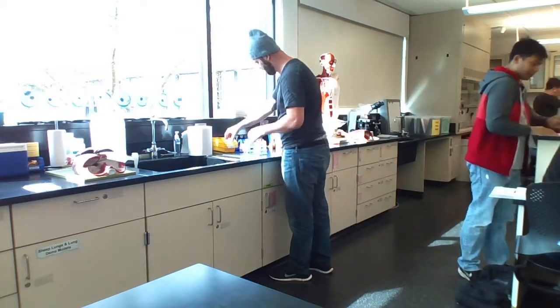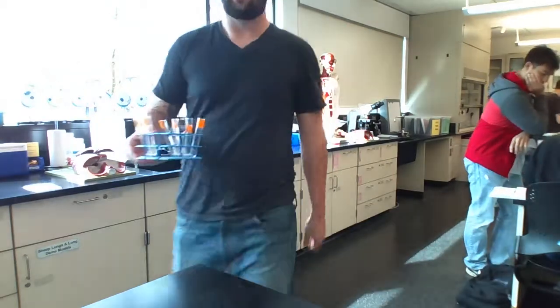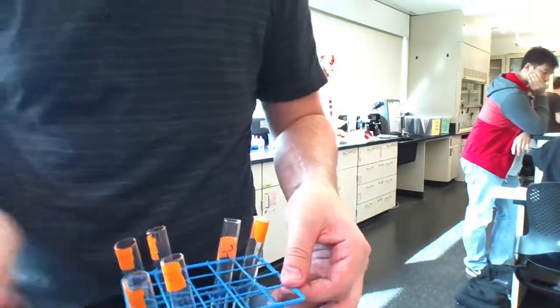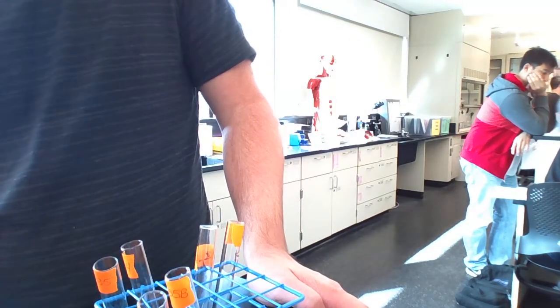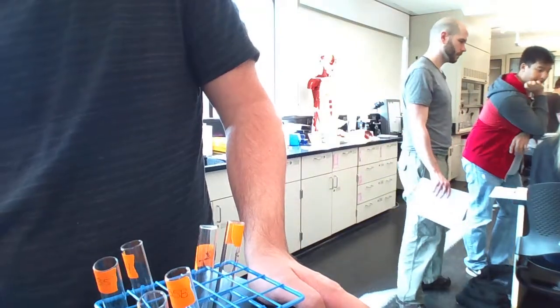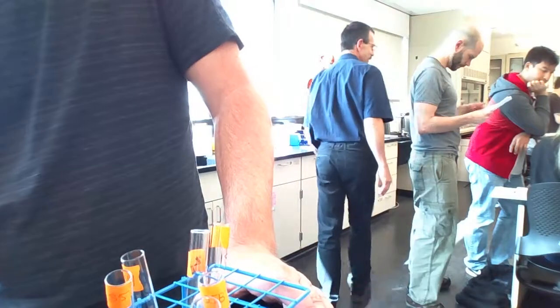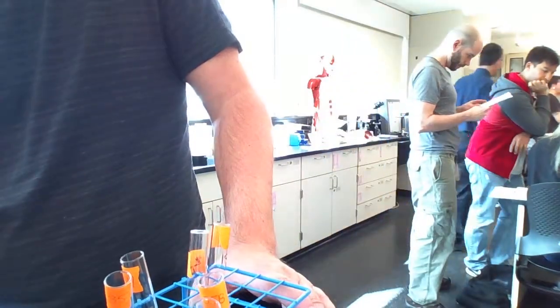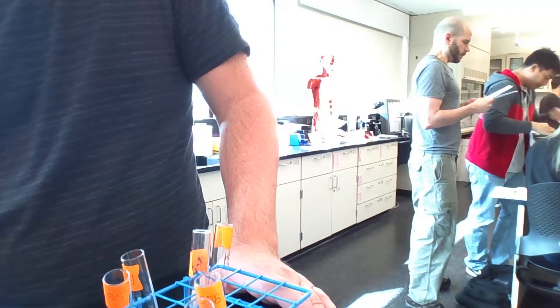Okay, so this is really the best instructions. Oh, they're 5 drops. So now we're just waiting for that to finish and we'll add the litmus cream to that one. And then we'll do this one. We'll have to put it all in there. Yep, he just did that. Did you tell the camera? Did you smell it?